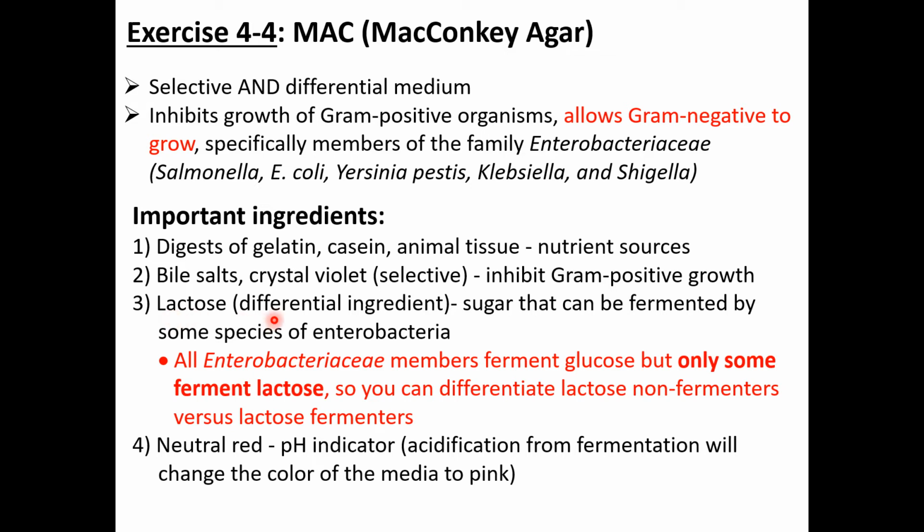Well, the goal in here is not to just have glucose for all of them to use. We want to use a sugar that could differentiate them, so it can split them apart. From all those different types of coliforms or Enterobacteriaceae members, some of them can ferment lactose, but some of them cannot. So here the goal is to differentiate lactose non-fermenters versus lactose fermenters.